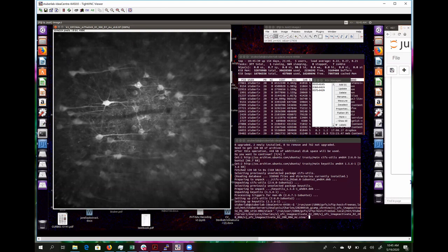If changing values in your data analysis pipeline will change your final output and what your claim is going to be, then you have to be super careful about your claim.